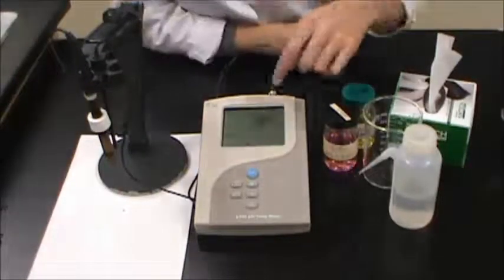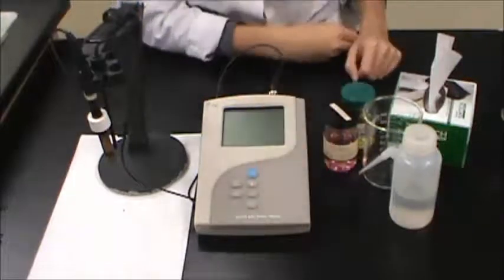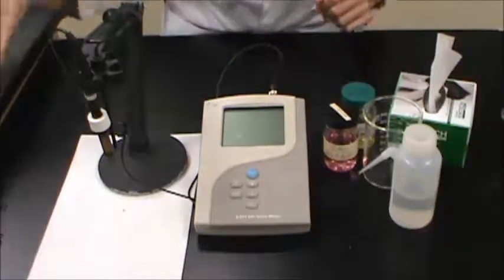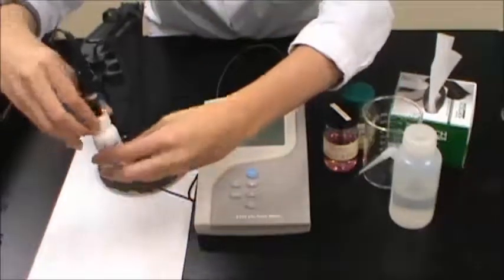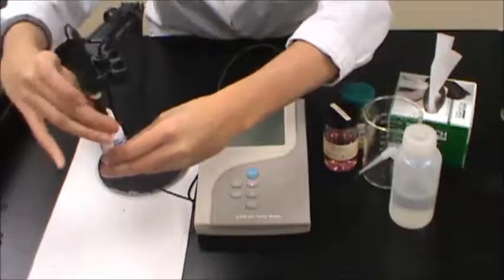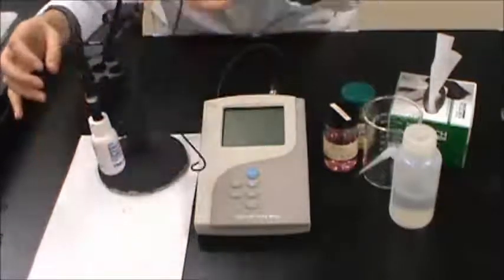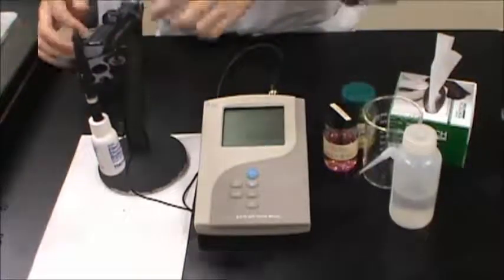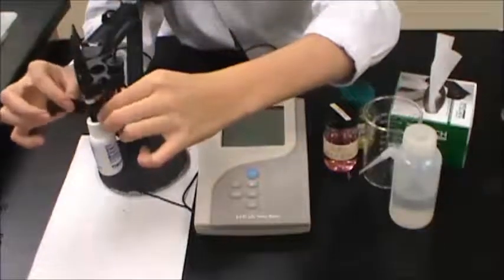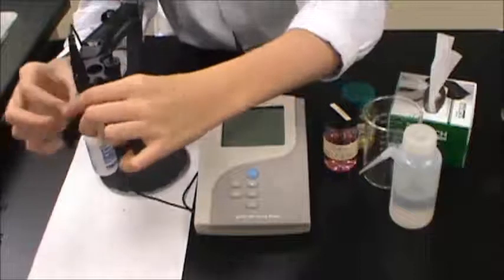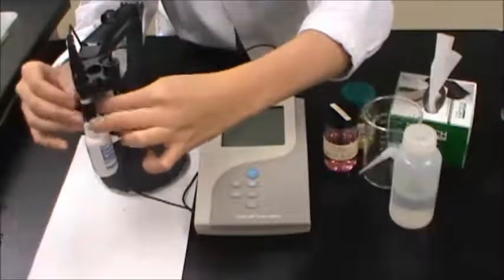The instrument can also be turned off whenever you are finished using it. Replace the electrode storage bottle on the end of the pH probe and put the black tape back over the vent hole of the pH probe.